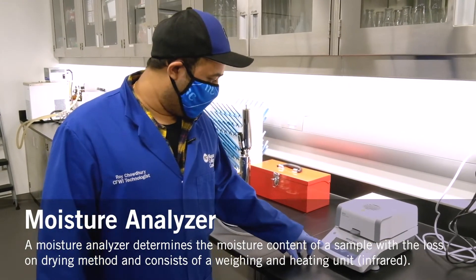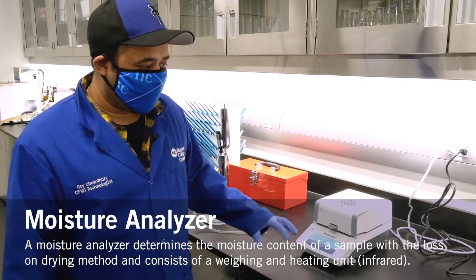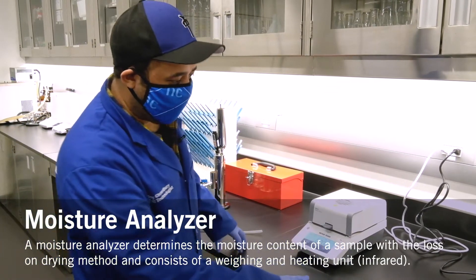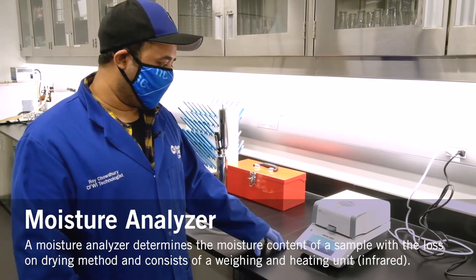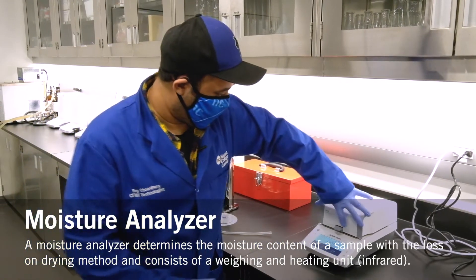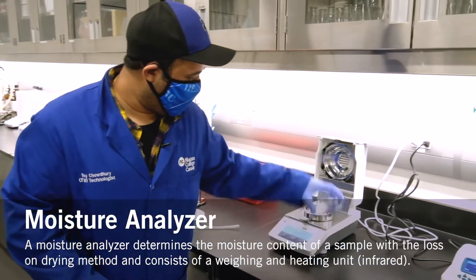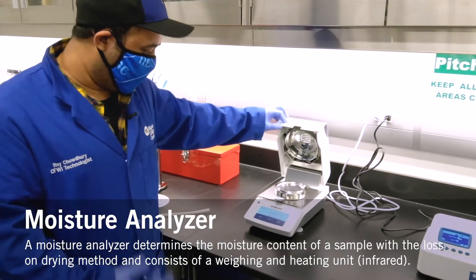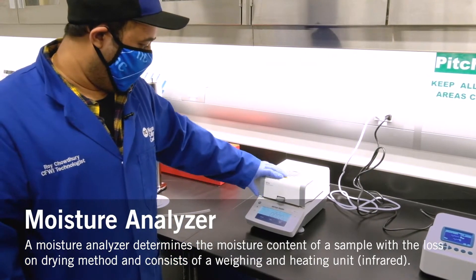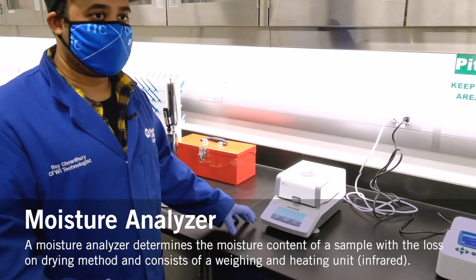This is the moisture analyzer. It's typically similar to the water activity meter, but this actually measures moisture directly. You just place your sample in this compartment here, and once placed, it heats up — as you can see there are heat coils. It starts heating up for about five minutes and gives you a reading of how much moisture is present in the food product.